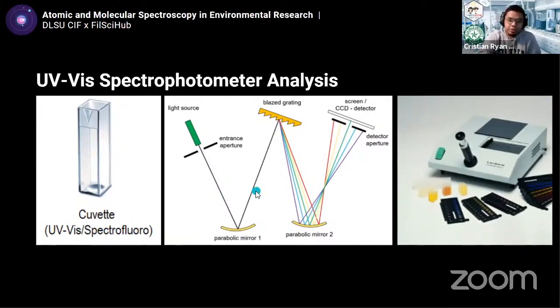In the middle here is what we call the monochromator. In modern UV-Vis, this is inside. This part of the instrument is used to filter out the light. As you can see here, the light is still complete, and then it's diffracted by the grating. Later on, we see that when it reaches the detector, only one wavelength or a very specific shorter band of wavelength comes out.